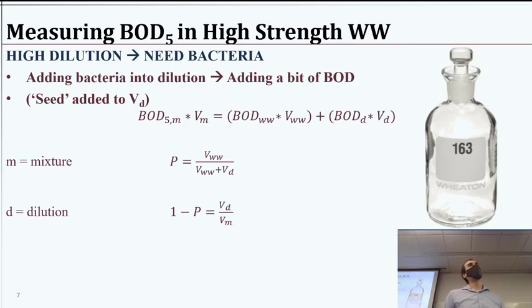So we're going to end up adding a little bit of substrate to our solution, which will complicate things because we're then adding some oxygen demanding substance when we're trying to measure just the wastewater. It's going to complicate things a little bit, but our equations will take care of it for us.